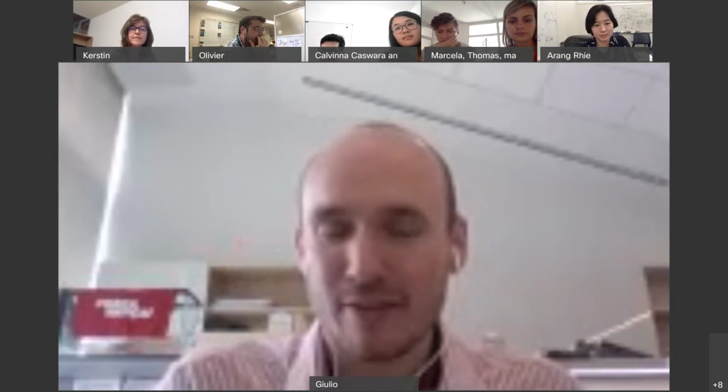I mean, Olivier has been doing something very similar recently, to just check for contamination and that sort of thing. We can probably rely on a curated data set of all the mitos that have ever been spotted at some point, and we can say, okay, let's try to see if there is any mito other than the mito I'm looking for. So that's something we can look into.